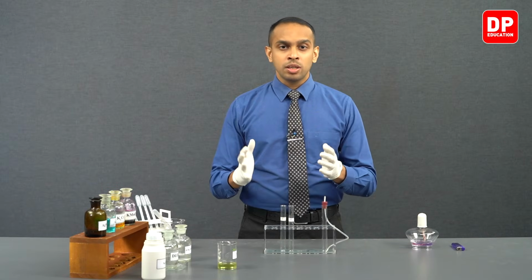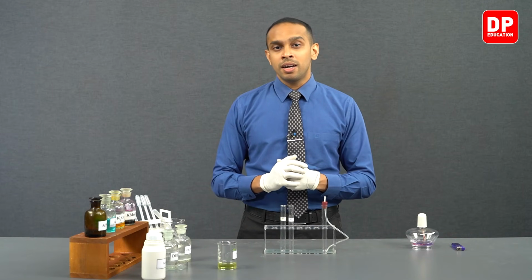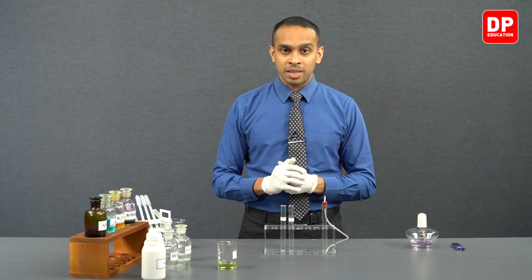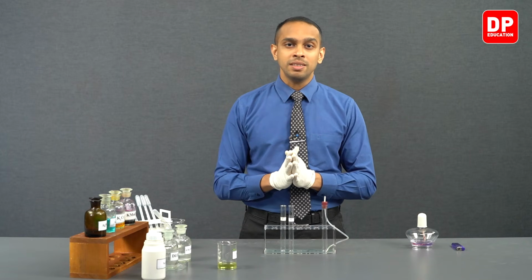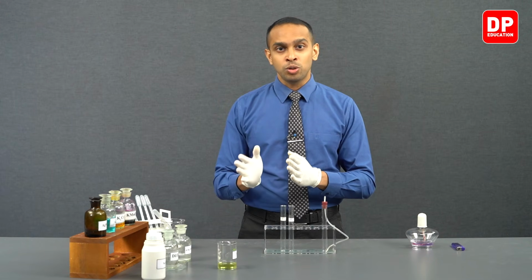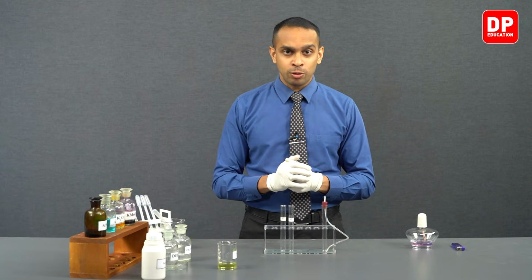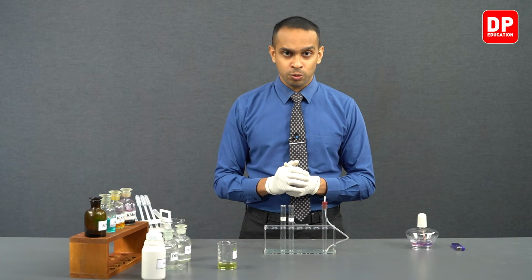So when Cu2+ ions come into contact with sulfide ions, they form copper sulfide, or more accurately, cupric sulfide. Cupric sulfide is a black color, water insoluble precipitate. So you will observe the formation of a black color water insoluble precipitate when we introduce Cu2+ ions into our sulfide ion, S2-, solution.